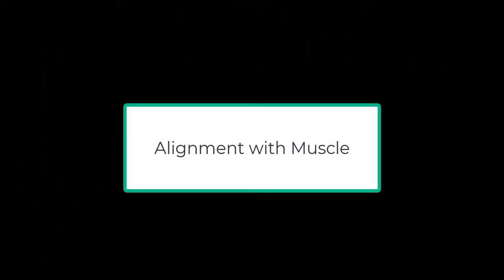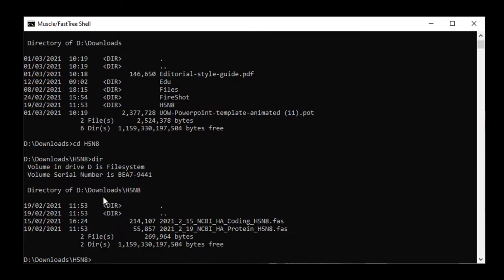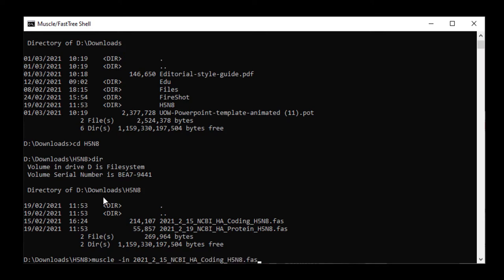The first step is to align the sequences with Muscle. The basic command is muscle -in input file -out output file. In this case, I'm going to first align the DNA coding sequences. Notice that once I start typing the name of the input file, there's a rapid jump to the name.